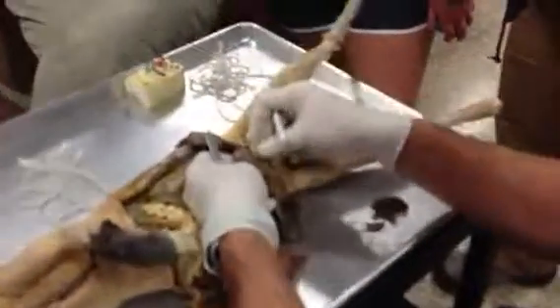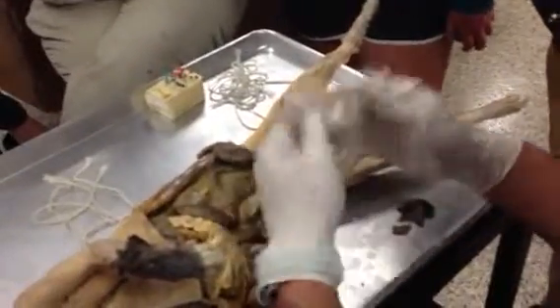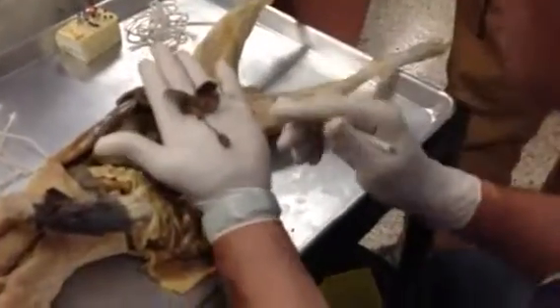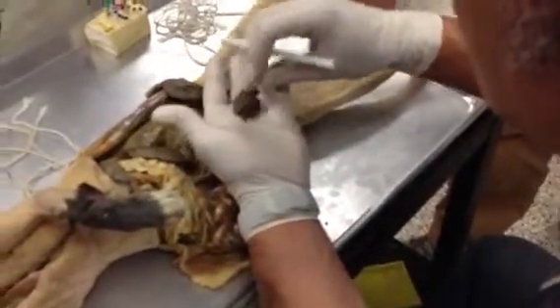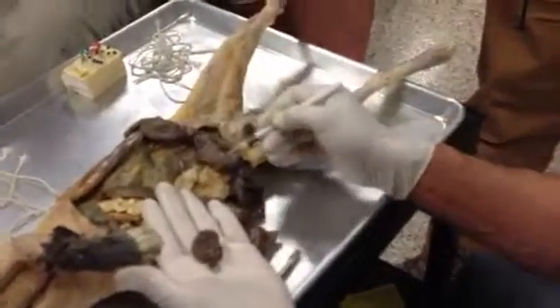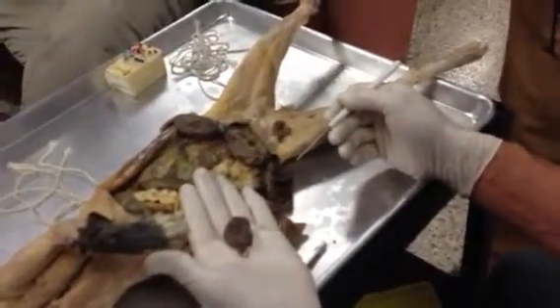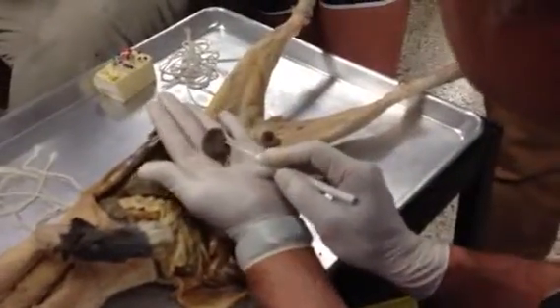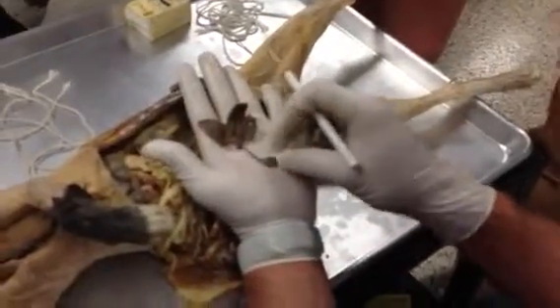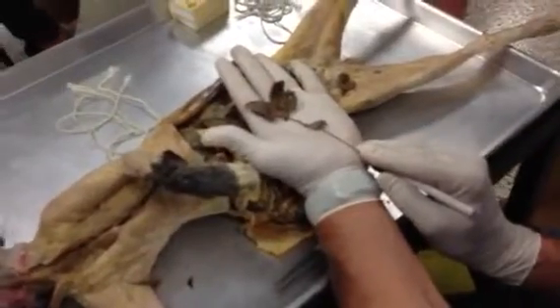Alright? Out of which now, during early development, it will be an embryo. All embryos look the same. And now here, we've got the placenta that's developed. Okay, let's put it in the way it is, like that. So there's the placenta, and each of these will have its own placenta. So if there are 8 offspring, there'll be 8 placentae. Right? And it's very early on in development still, or fetal development, and there is the little kitten right there. Very, very early in development. But because it's looking like the adult, we call it the fetus now.